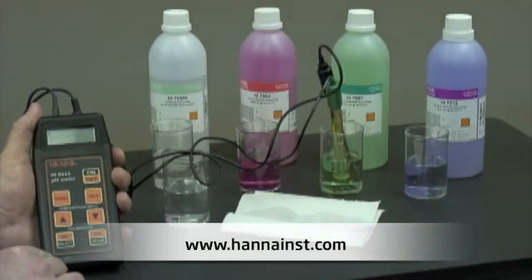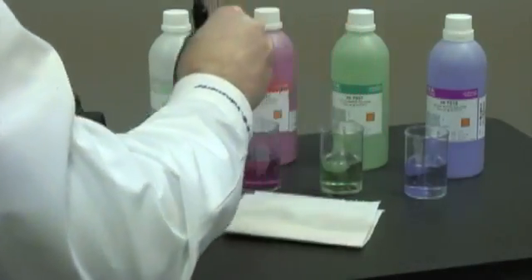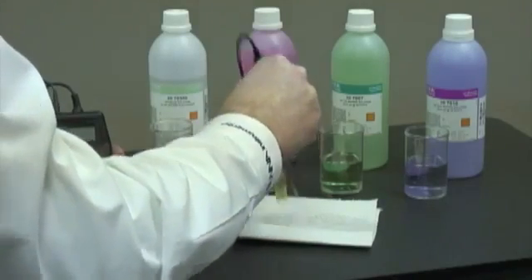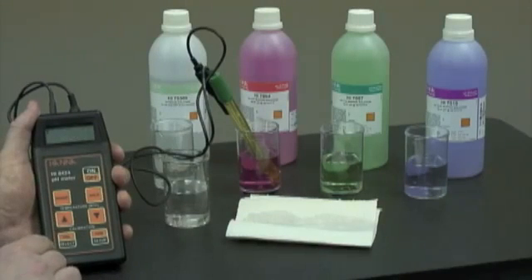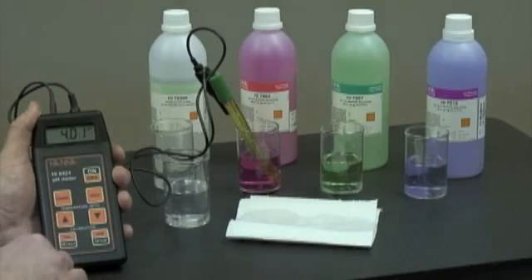Now it's prompting us for pH 4. You can use either pH 4 or 10 if you want to do a two-point calibration. In this case, we're going to measure an acid, so we'll use pH 4. Now we just need to wait for the confirmation and press the button. Now we're ready to measure.